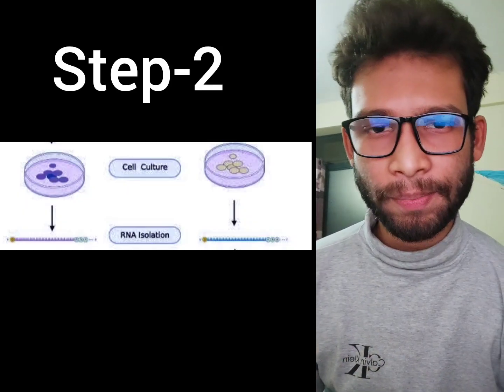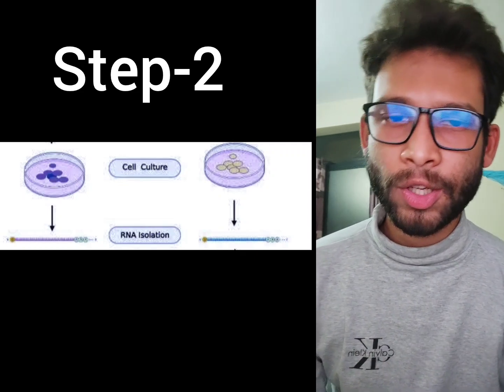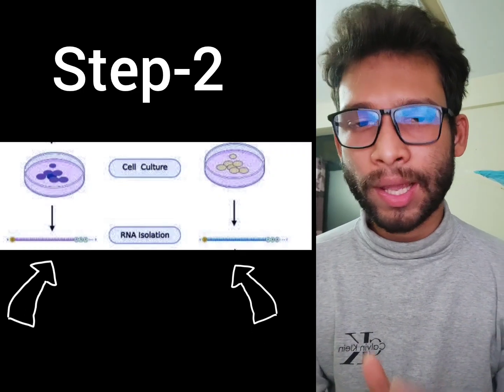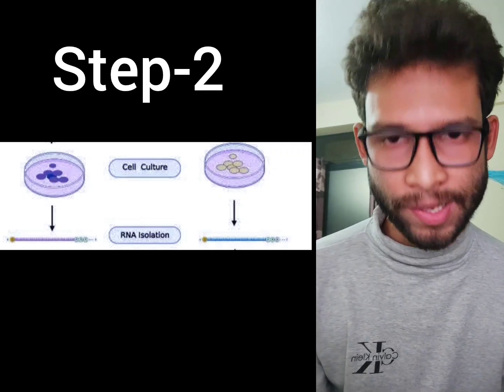The second step is called mRNA extraction or RNA extraction. In this case, all you need to do is to extract the mRNA from both samples. Here, mRNA represents the genes which are being actively expressed.